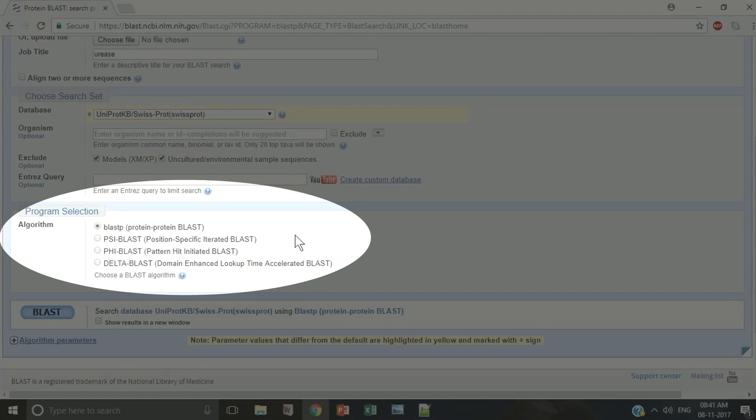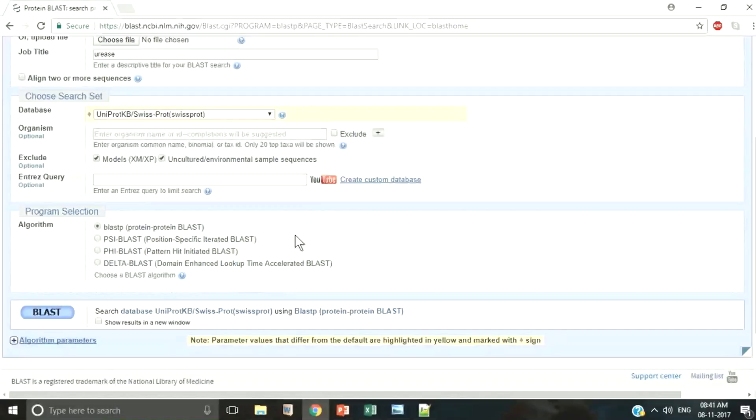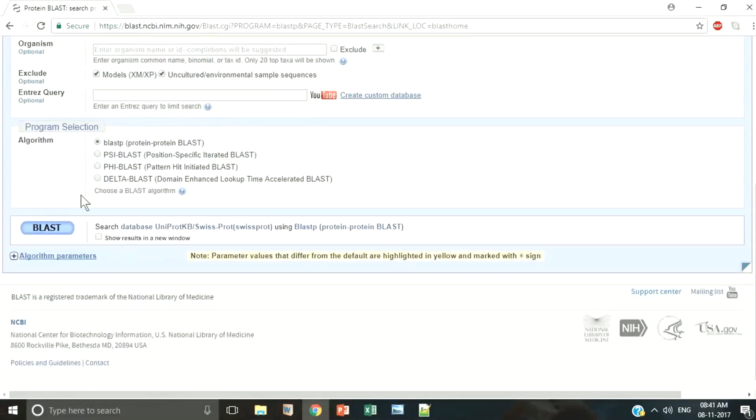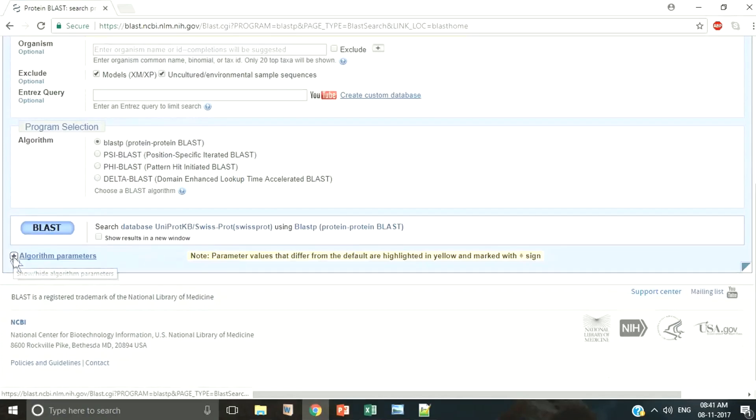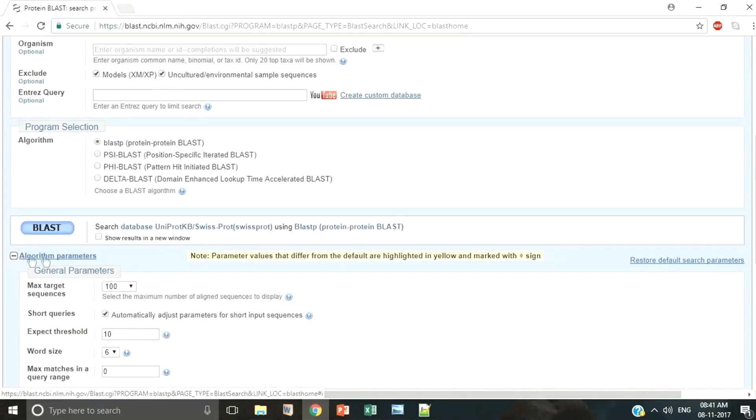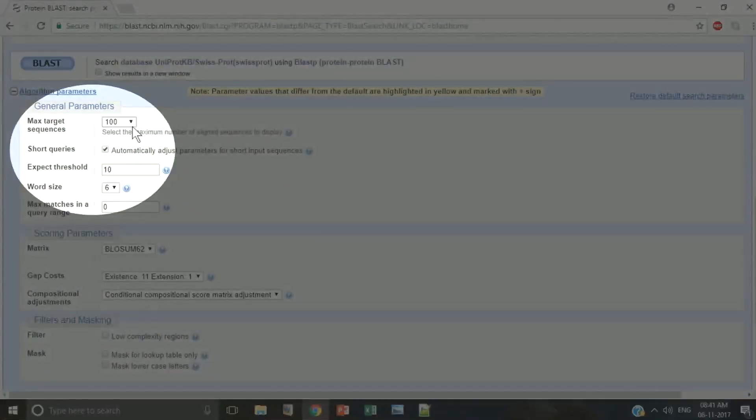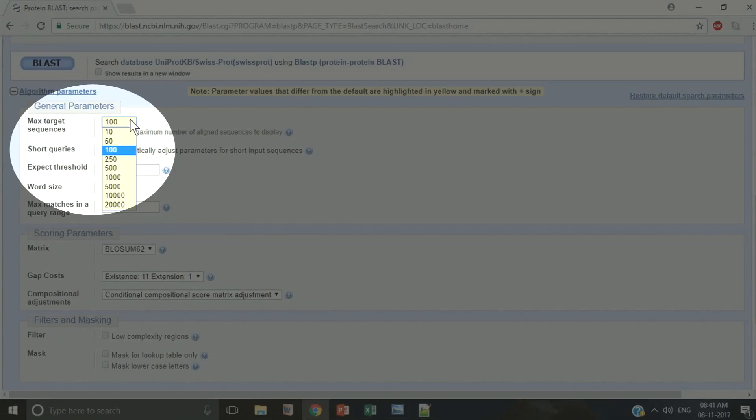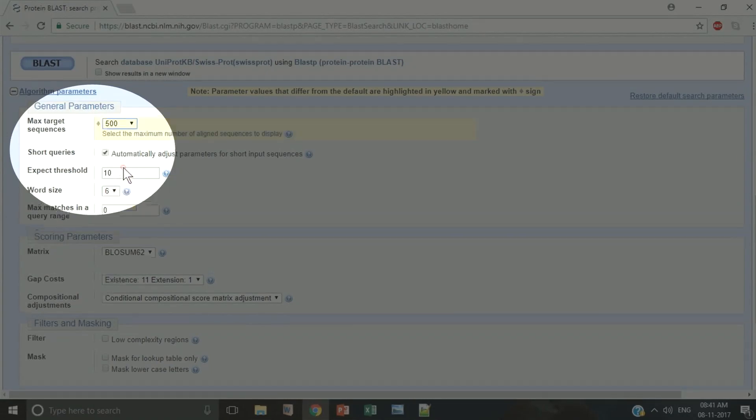You can find the link of this video in the video description below. For now let us choose any algorithm and proceed to choose the algorithm parameters. See here maximum target sequences is how many maximum possible BLAST hits you want.